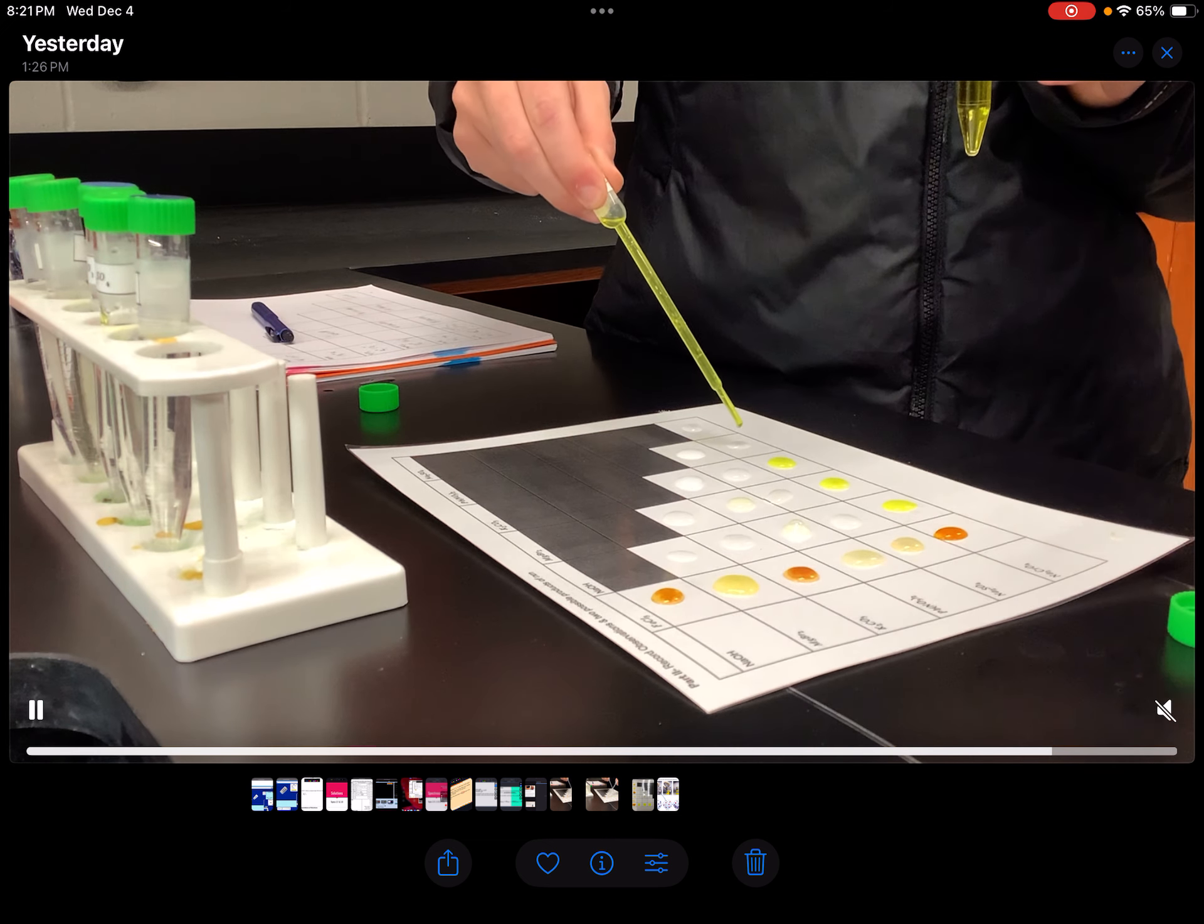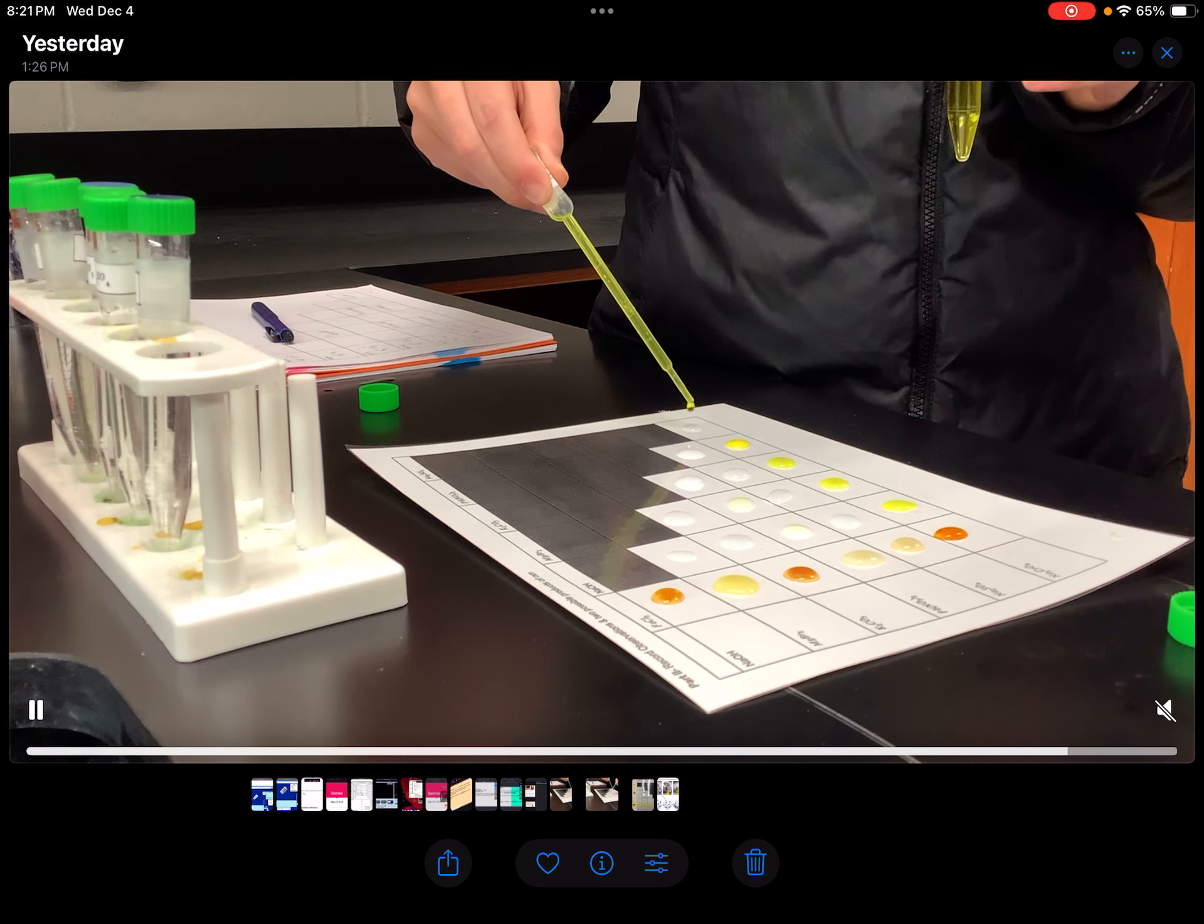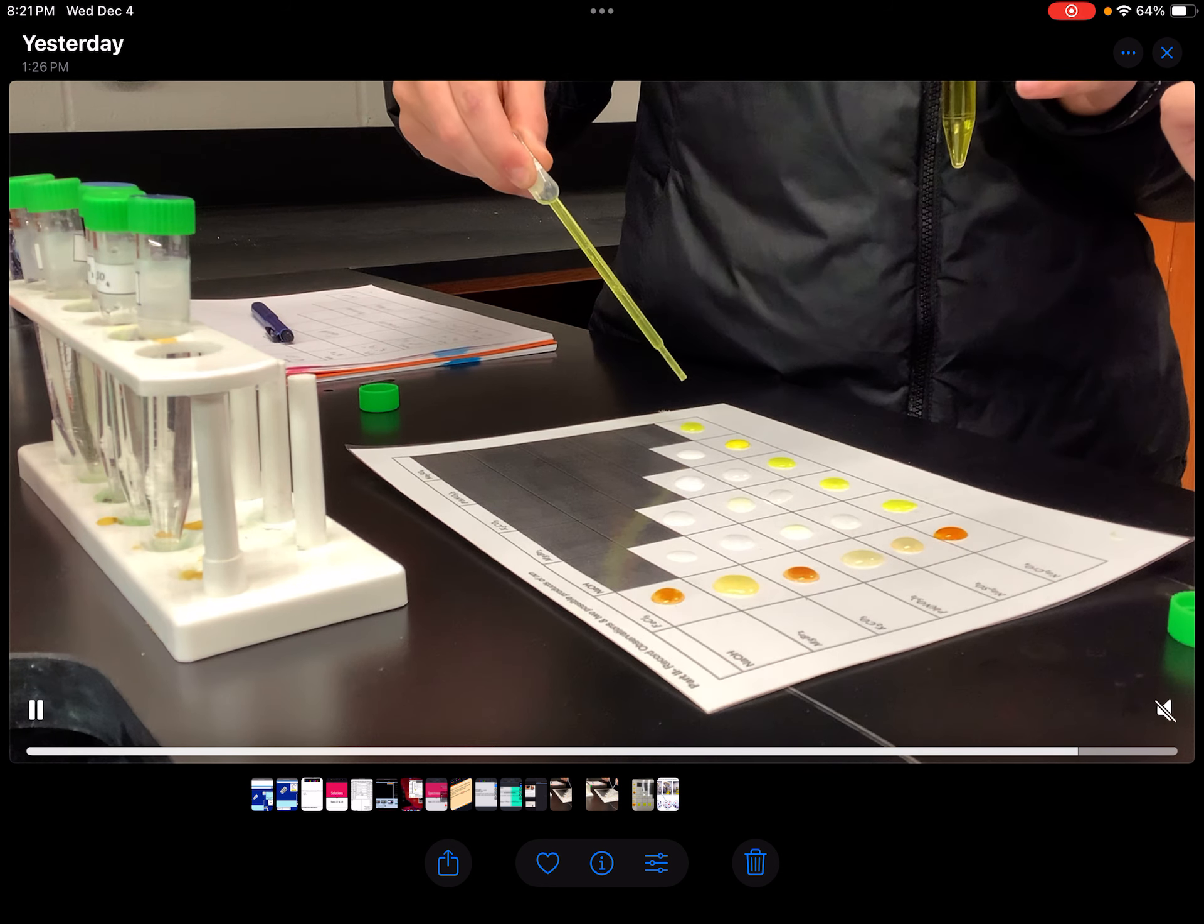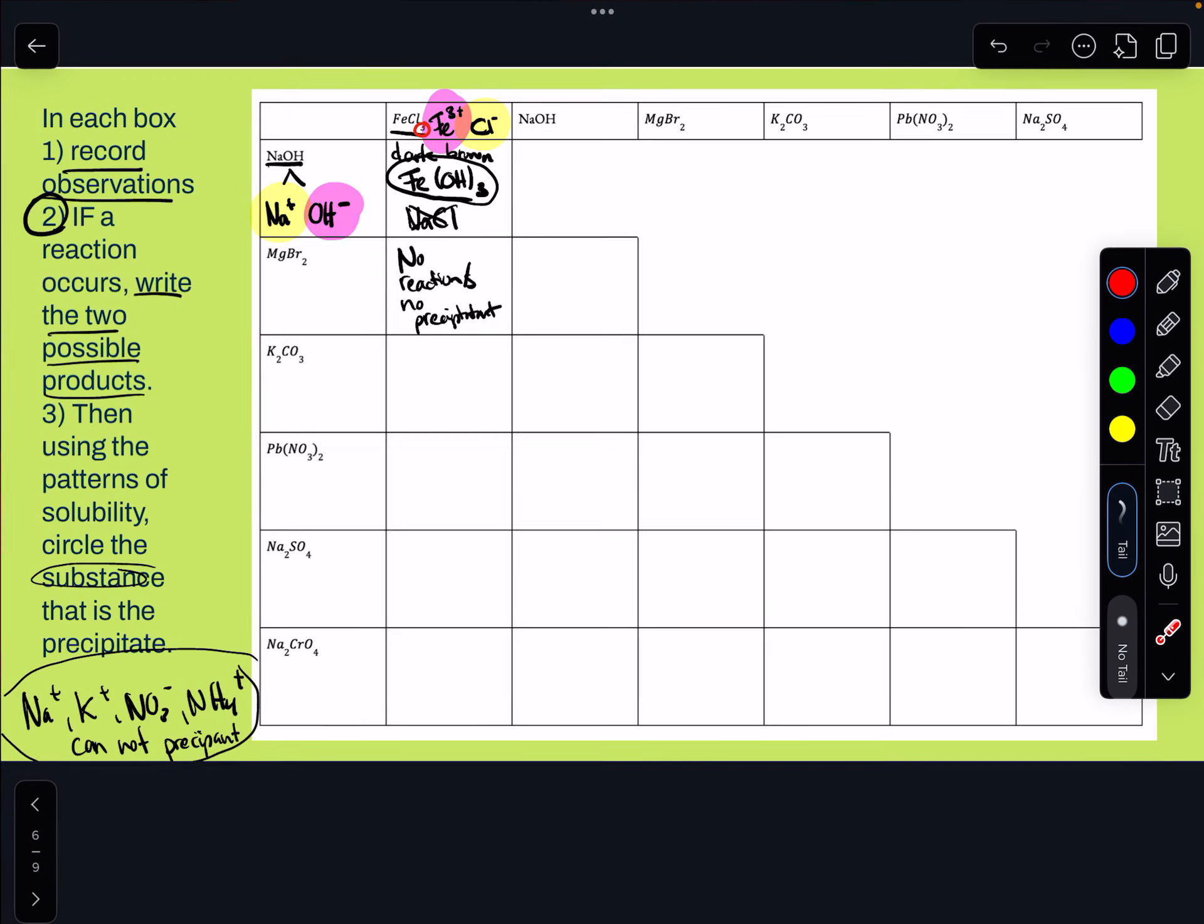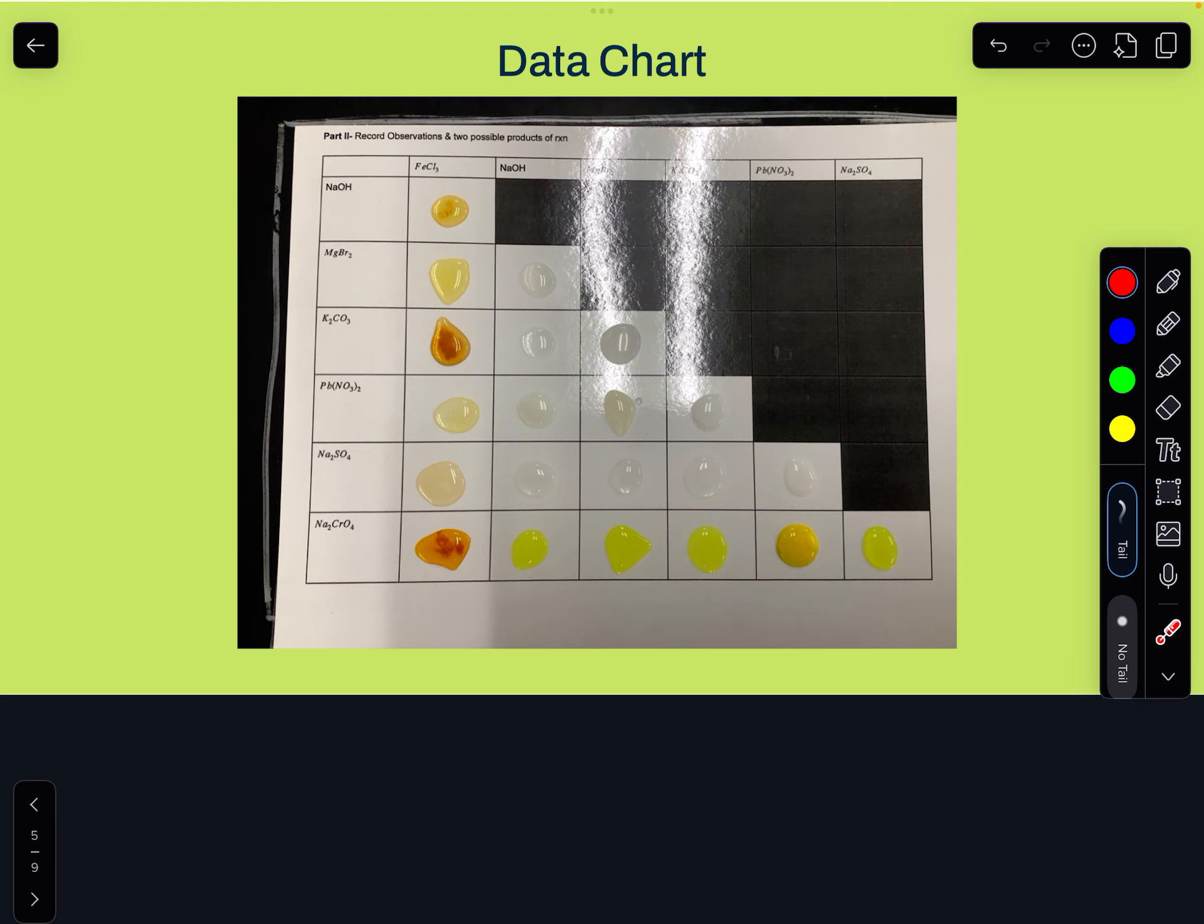Watch this next one here. Notice how different it is. Do you see how that yellow is a little bit brighter? So we can see our different precipitants. So here, here, here, and then we definitely have that precipitant there. And then the white ones are a little bit hard to see against the white paper, but we had precipitant here, precipitant here, and precipitant there.